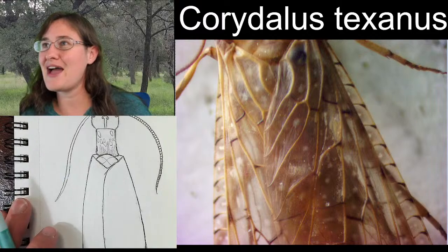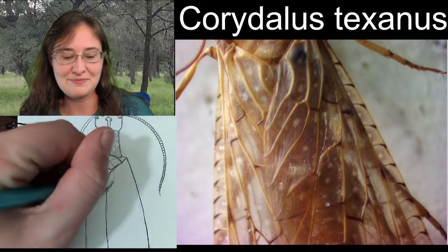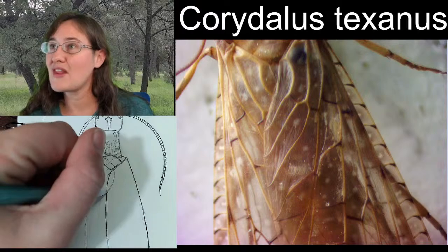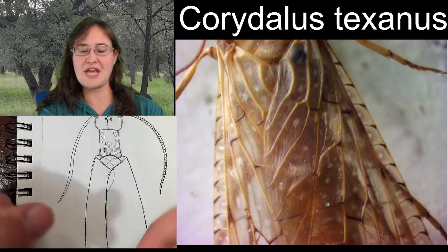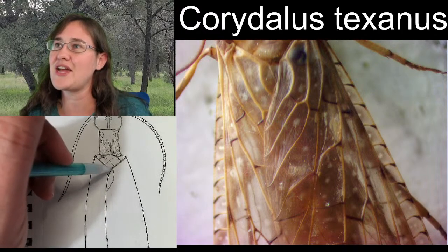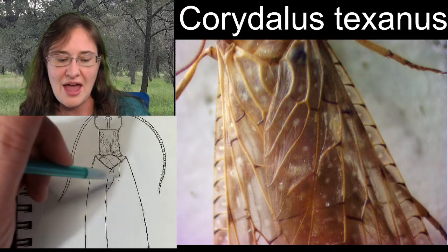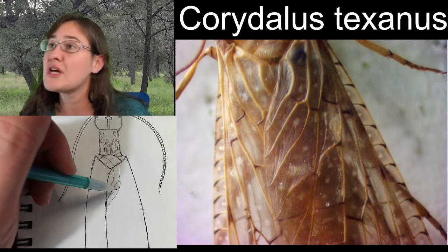Alright, let's see how well I can sketch some of these wing veins. A lot of these veins are going to be angled kind of down and towards the center. So we start with, I like to start on an edge. So I'm going to go ahead and start with this guy, and then this one that forks so nicely and comes around.